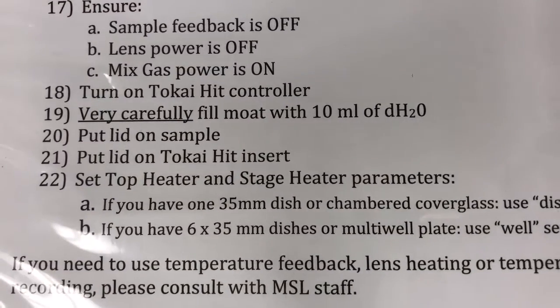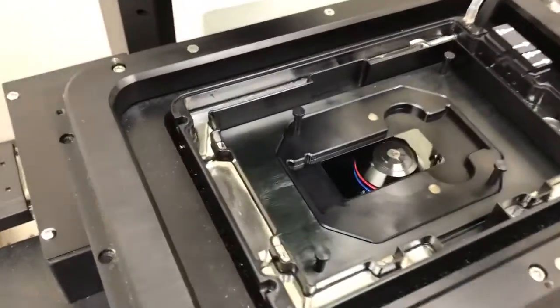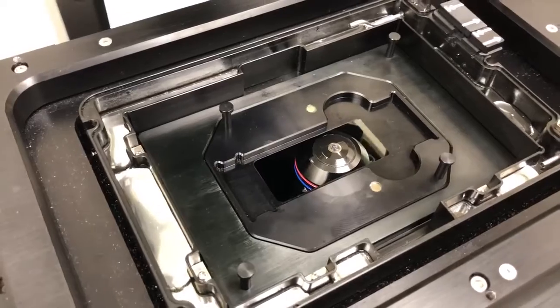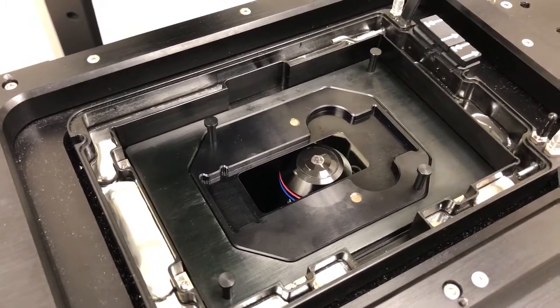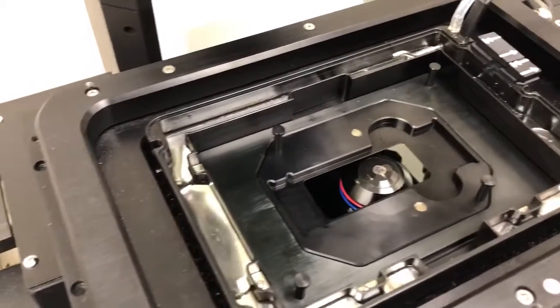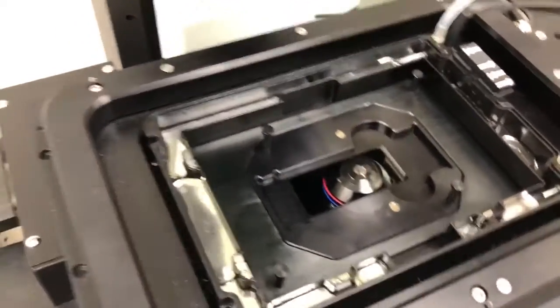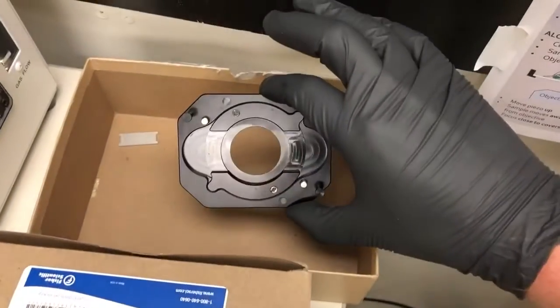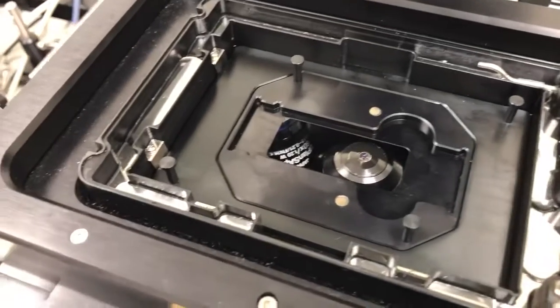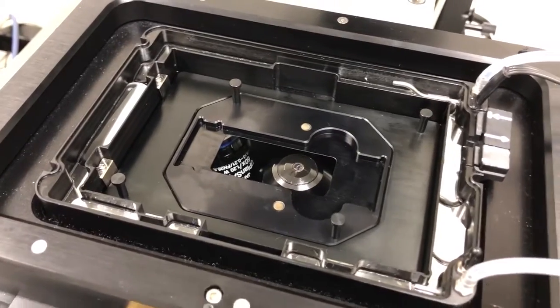The next step, step 20, is to put the lid on the sample. This won't apply to us now, but the idea is that when you're using a live sample, we're going to place the sample on — it could be, for example, a NUNC 2-chambered cover glass, or it could be a 35 millimeter dish. In either case, we're going to remove the plastic cover of that sample and then put on a special cover that is compatible with this. I'll show you where those covers are.